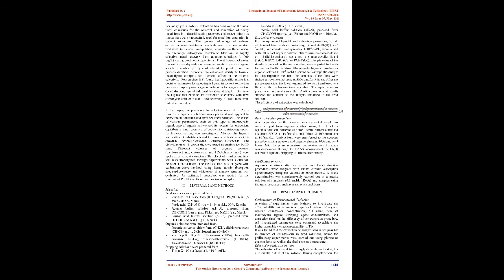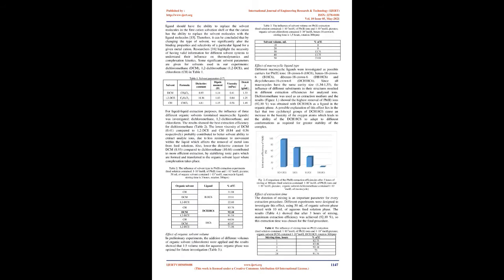Stripping solutions were prepared from Triton X-100 surfactant, 1.4×10⁻³ mol/L, disodium EDTA, 1×10⁻³ mol/L, and acetic acid buffer solution, pH = 5, prepared from CH3COOH, Puris PA, Fluka, and NaOH, GR, Merck.